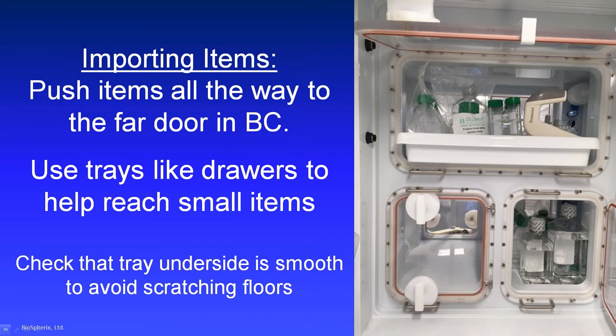Now, if you do use a tray, make sure to check that the underside is perfectly smooth. You don't have any sharp little plastic bits or little feet that are scratching the floors in the buffer chambers. You don't want to scratch up the floors.